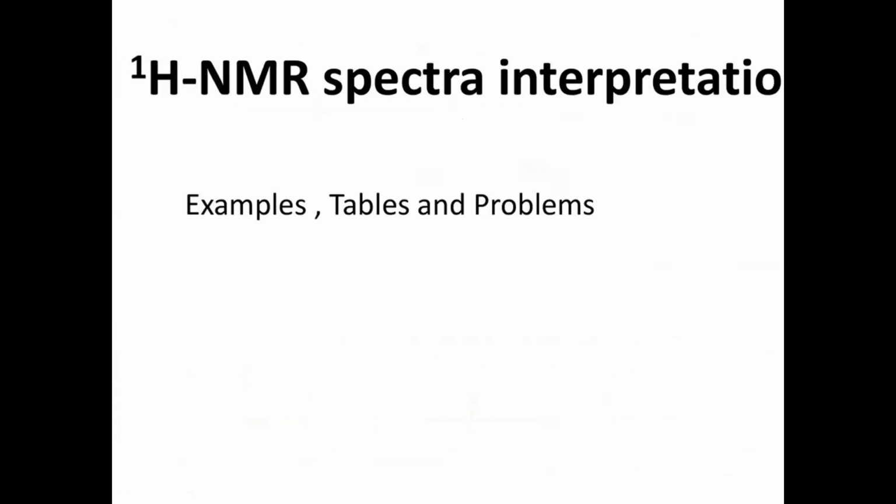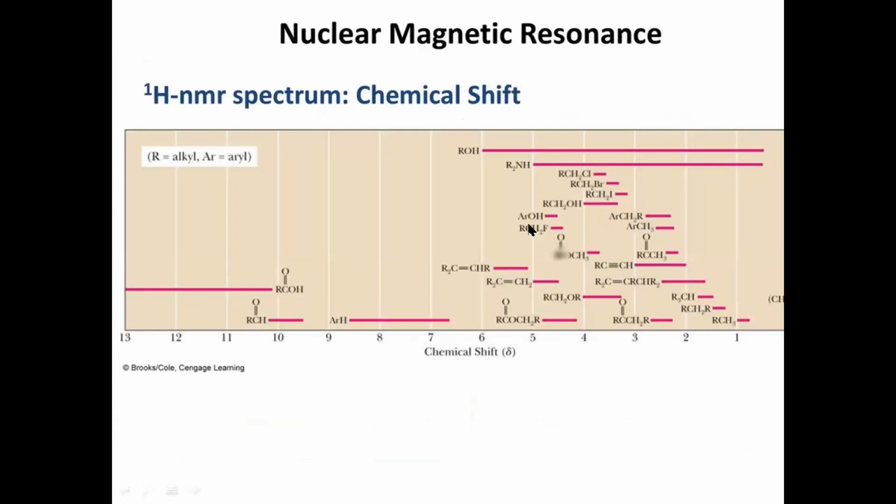So hello everyone, and today we are going to discuss proton NMR spectral interpretation. In this we will explain examples of how you can interpret NMR spectra, and I will also solve some problems. So come to the first slide.